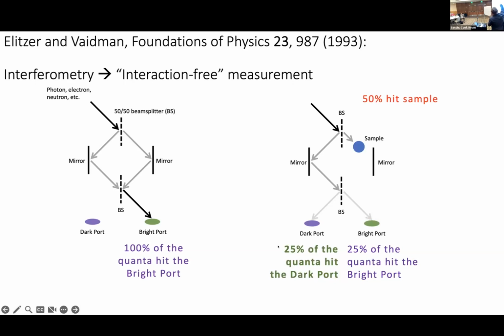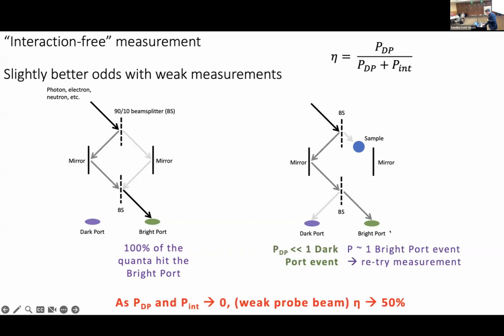The question is, if that is an atom, we're not so concerned about blowing up the lab, we're concerned about altering the protein that we're trying to image before we have a chance to get sufficient contrast. And so if we can reduce the dose of electrons required to image that, or to determine whether there's an atom there or not, that can still be a sizable effect.